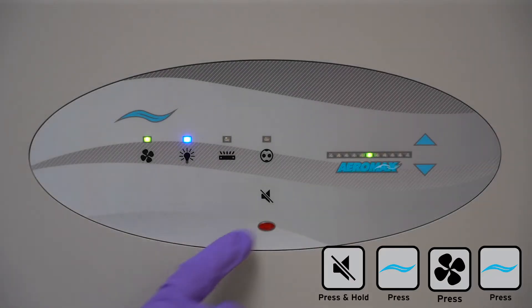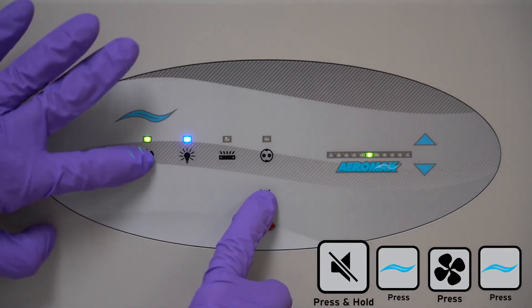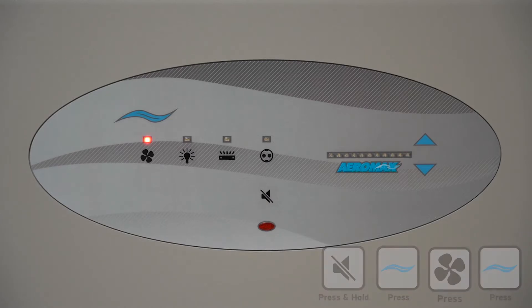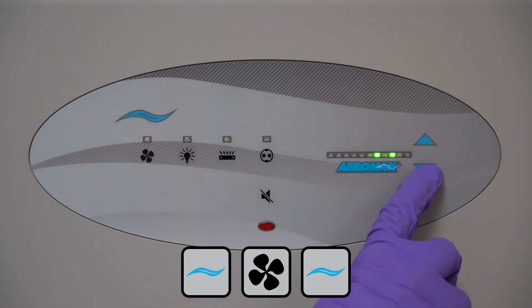First, enter the password menu using the key sequence shown. A blinking light means you're in. Use the arrow keys to move from one password option to the next.